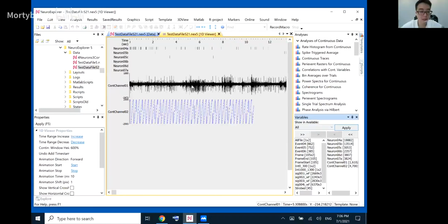Hey, Alex. Yeah, sorry to interrupt you. I have a very basic question. I saw the name of the file is NEX5. So usually after we recorded a file, how can we transfer the format of that file into a readable file of the NeuroExplorer? Usually, for example, for Alpha Omega, after we recorded, the name is dot .map or MPX or something.